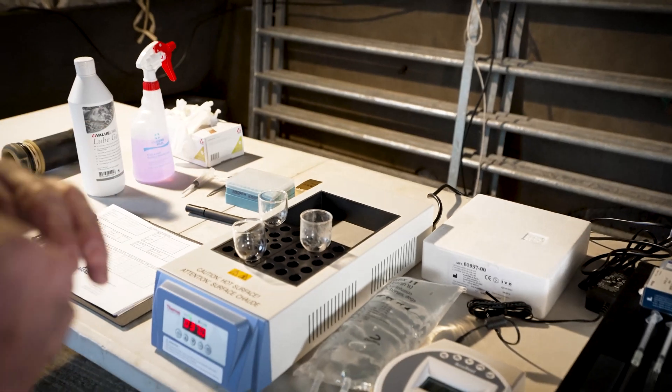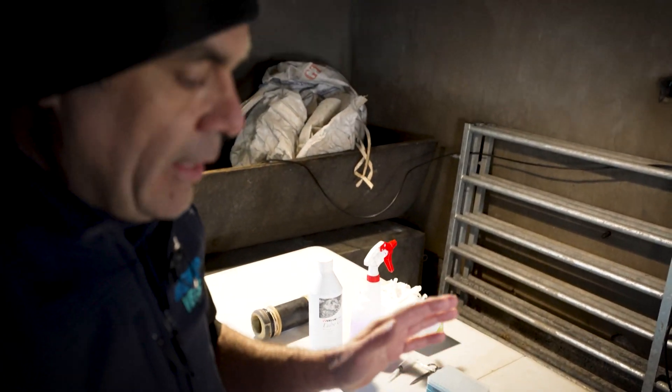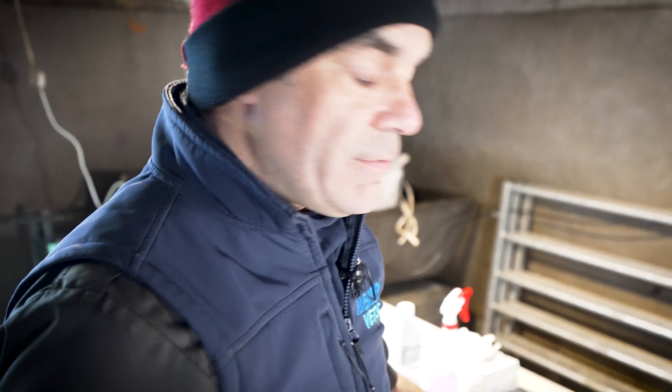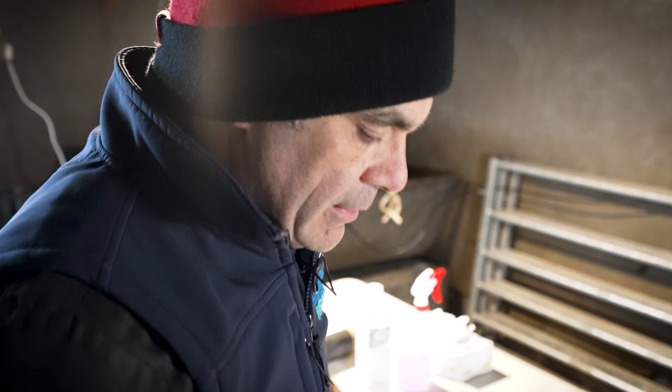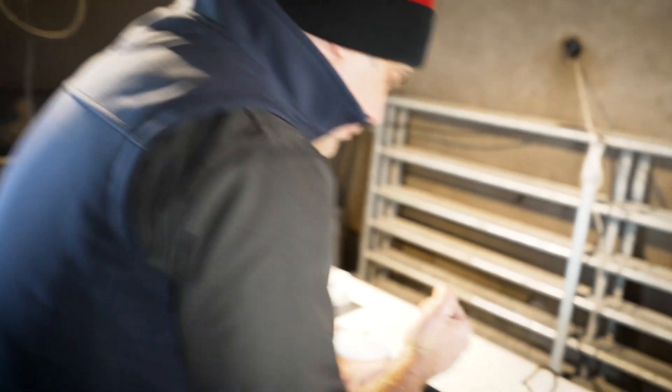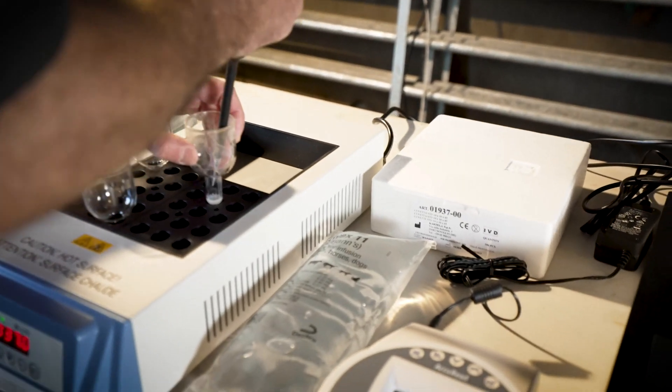This procedure is very important, particularly if we're AI-ing sheep or if we're doing embryo transfer. Also, increasingly, we've started using it for normal semen tests for cattle and for sheep. This automatic pipette here is set to take 10 microliters.